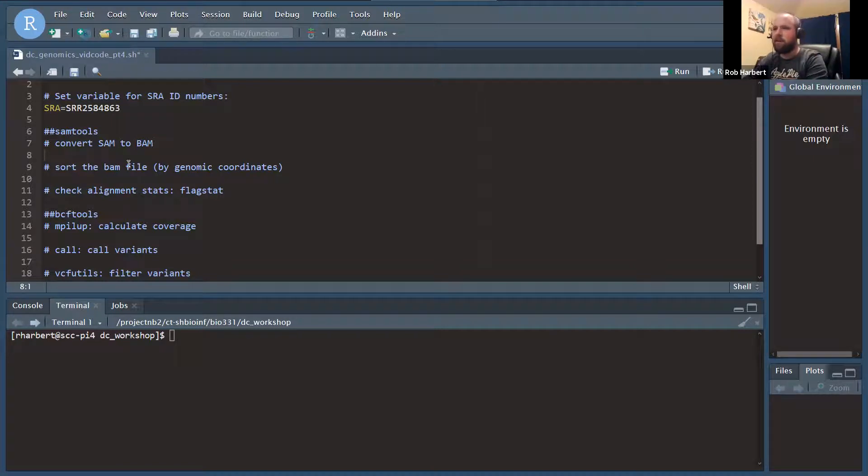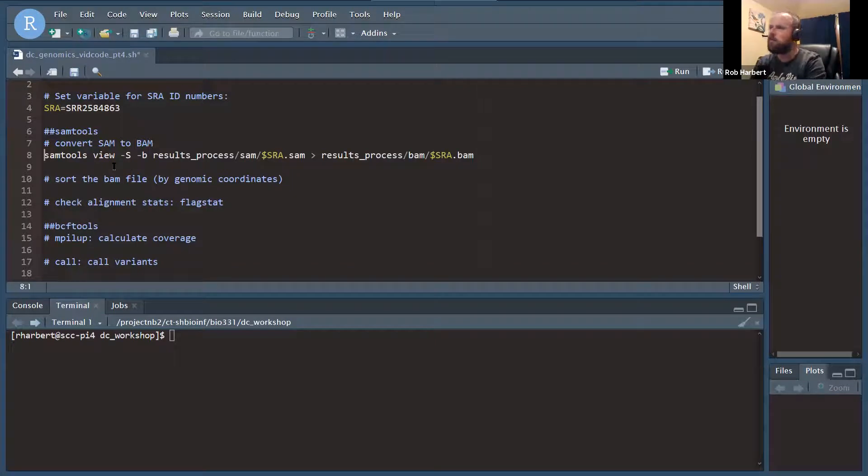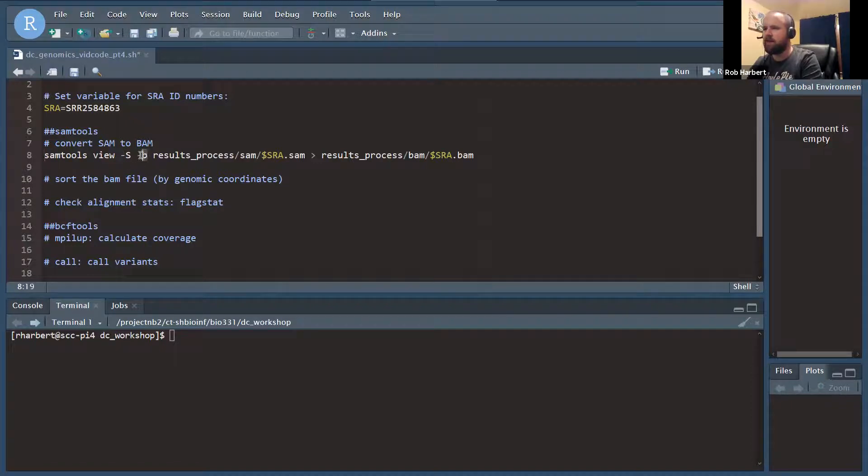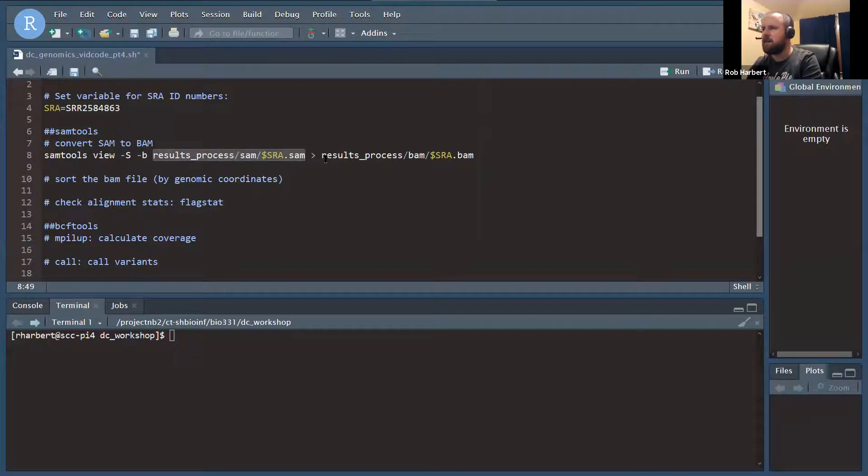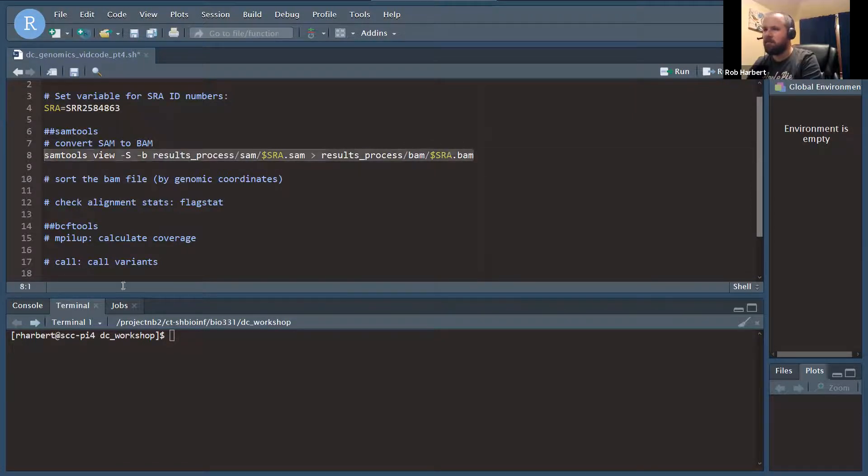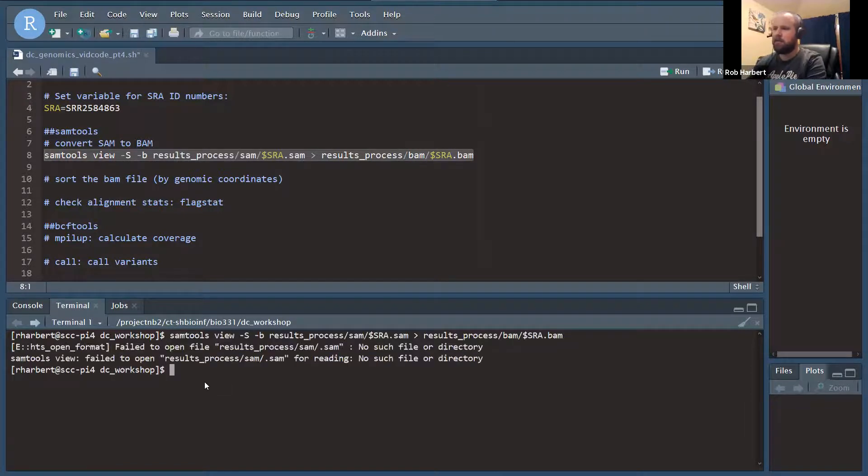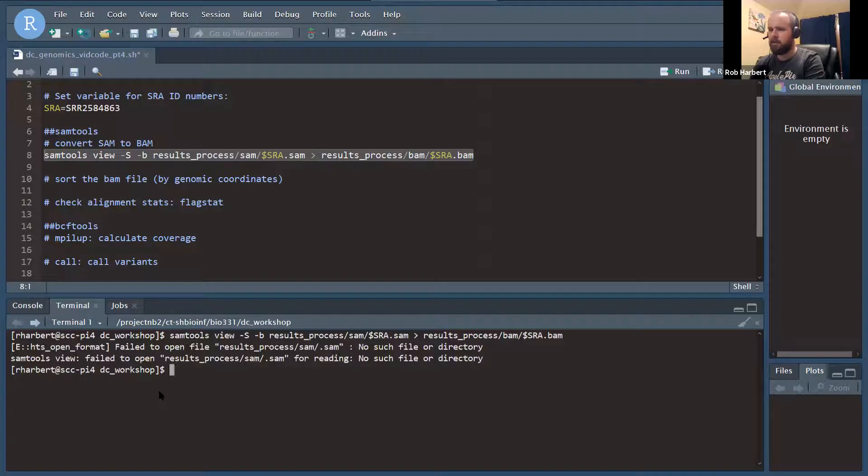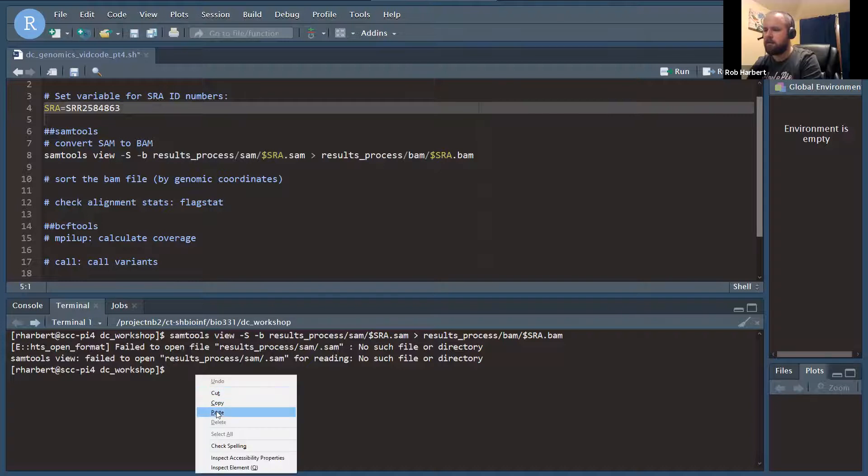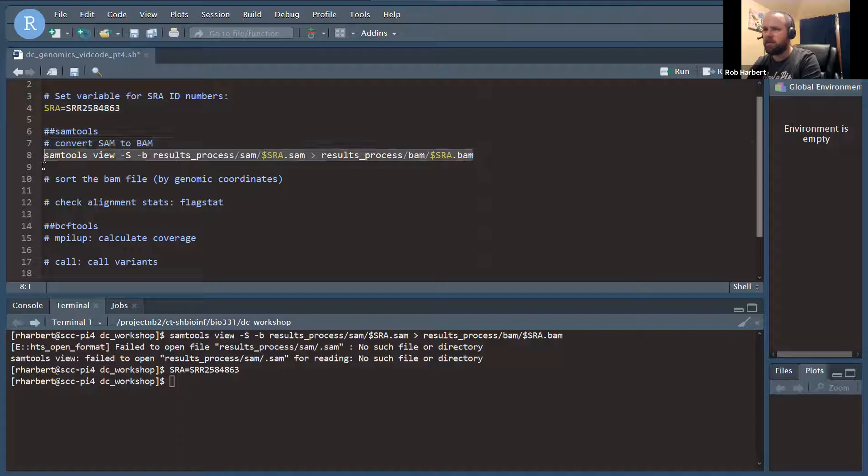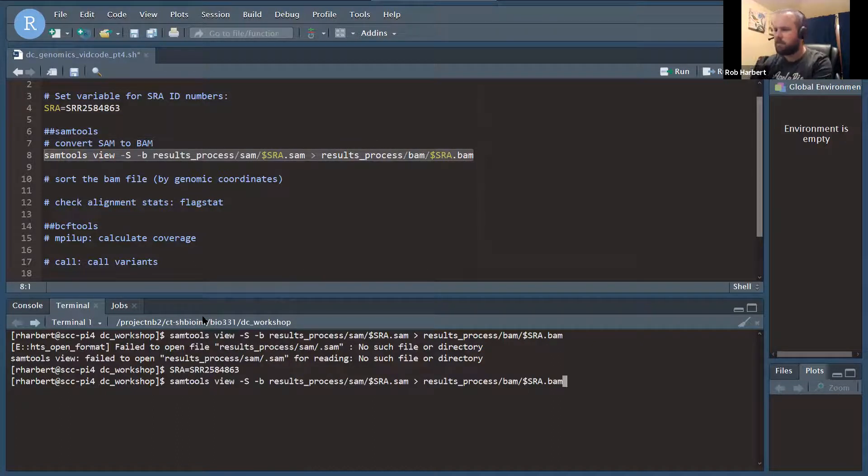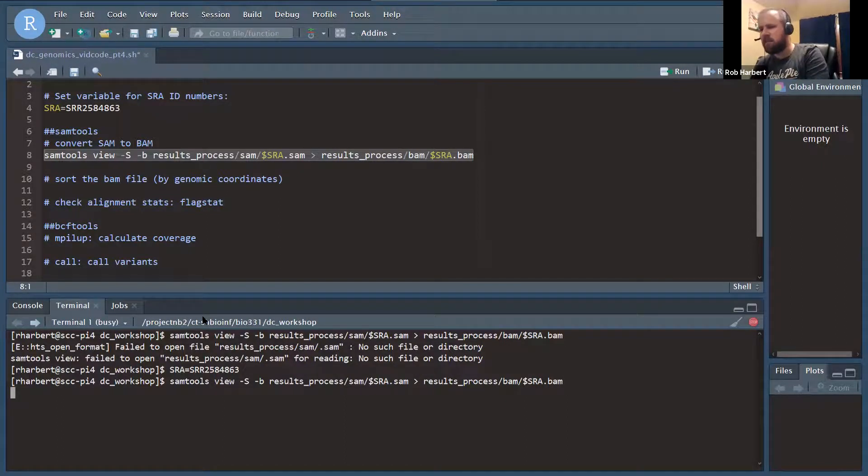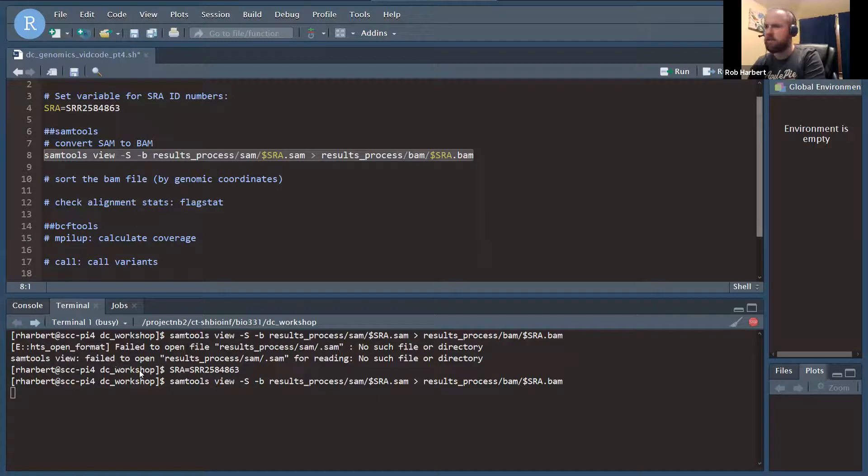We'll do these one at a time. It'll take a few minutes when I run each of these for you. First up, we've got SAM tools view, which is going to convert to a BAM file. That's the dash B flag right here, convert to a BAM file. We're passing in this SAM file and we are redirecting the output to a BAM file. I have my files in a folder called results process, and I have a SAM, BAM, and VCF folder inside of there. That's why we're working here with these relative paths, results process slash SAM slash and then a file name.